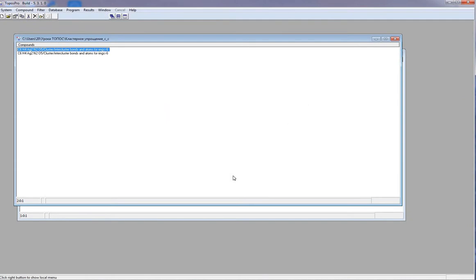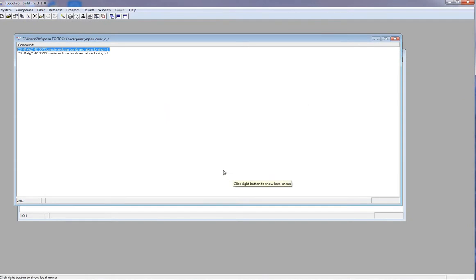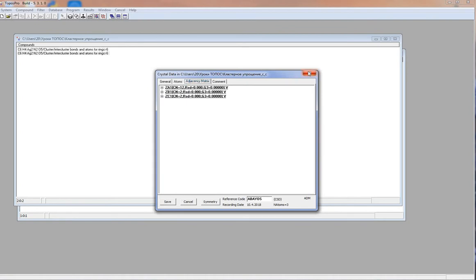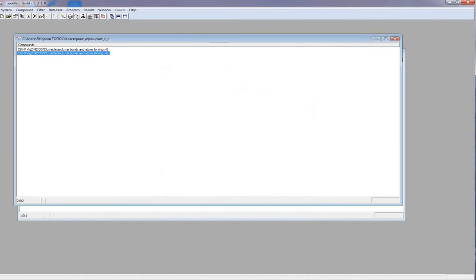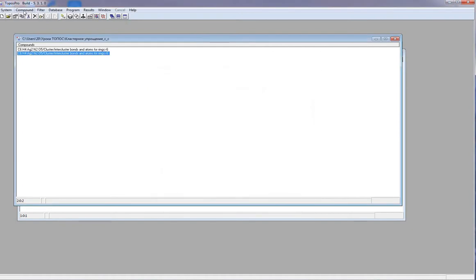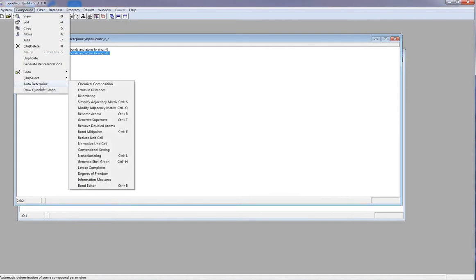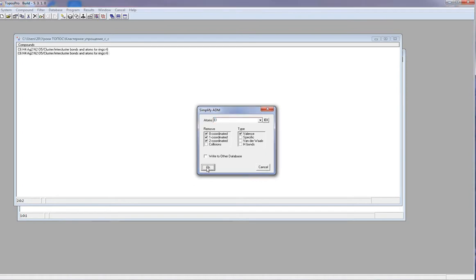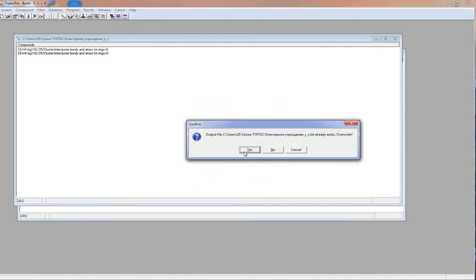We have simplified the structure and before classification, I have to delete all 0, 1 and 2 coordinated nodes. I open compound, auto-determine, simplified adjacency matrix, remove all 0, 1 and 2 coordinated nodes. Now I can classify it.